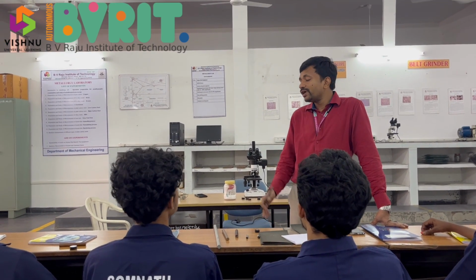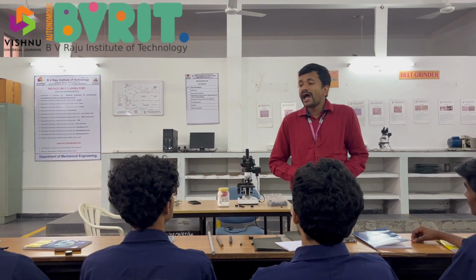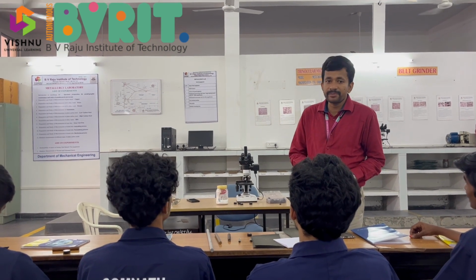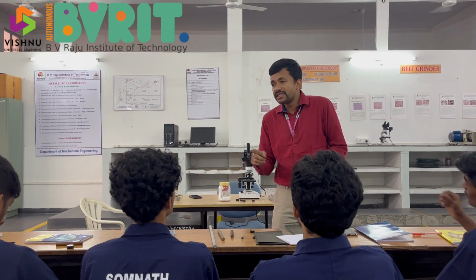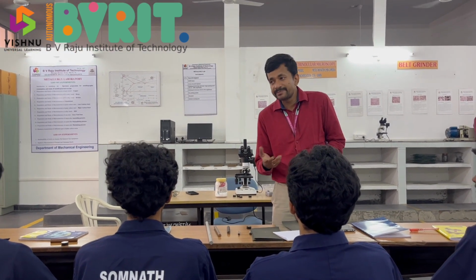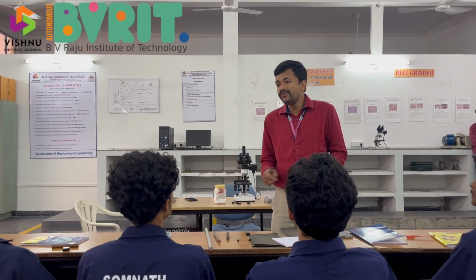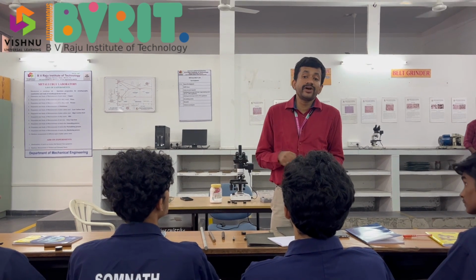Yes. Now I'll share the manual with you today, and in that manual all these experiments will be there. The first experiment, the 0th experiment, is about the metallurgical microscope, specimen preparation and an introduction. In that you have a table which will help you understand which etchant to use for which type of metals.